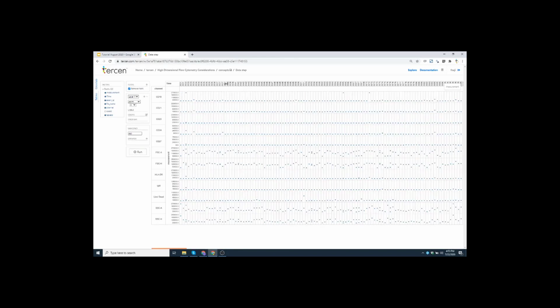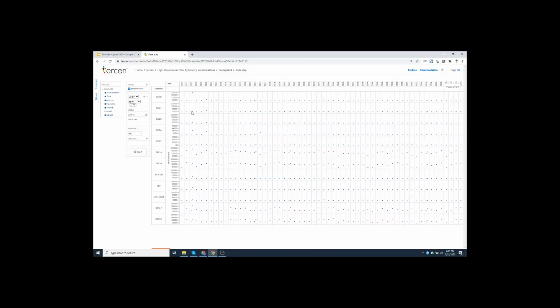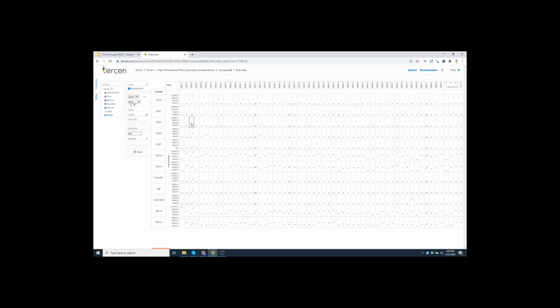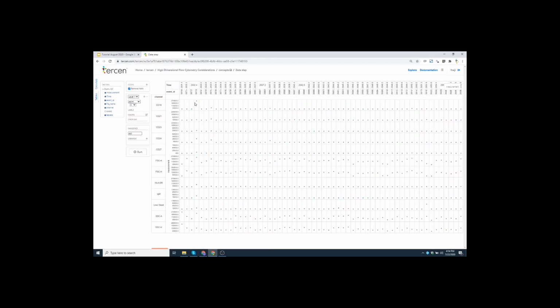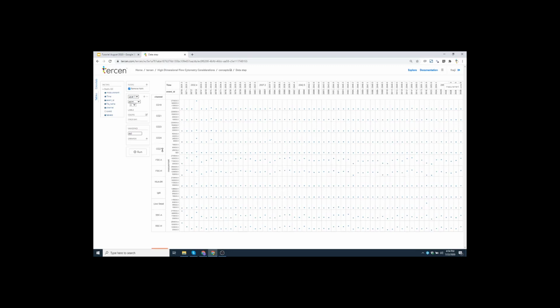Now, if I zoom in a little bit, you'll see sometimes you have 2 points in one cell. That's because at that time point, there were 2 measurements, and they get unique IDs, event IDs. So I can take the event ID annotation in the factor area here and drag it over my projection. I can put it below the time or above the time. It determines the order. So I'll put it below time because I want time to determine the order and the event ID to be underneath. And you can see now the points are separated.